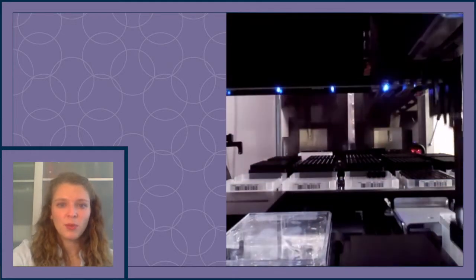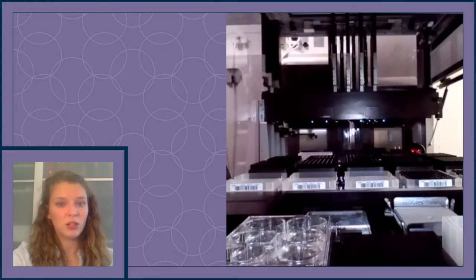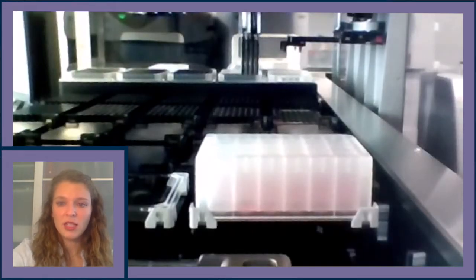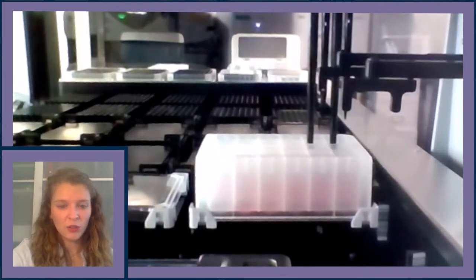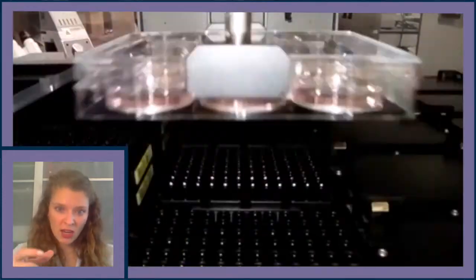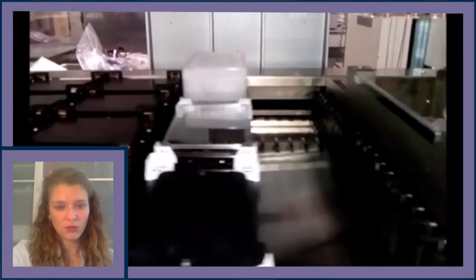After the 24-well microplate is prepared with seeding solutions, the pre-matrigel-coated six-well plates that have been incubating for two hours at 37°C are brought onto the tilt module. All matrigel is removed, and one milliliter of mTeSR1 plus rock inhibitor is added to each well. New tips aspirate 500 microliters per channel from row C, and the seeding solution is added at particular locations within each well using two channels per well, totaling 1000 microliters of cell suspension per well. The plate is lidded, picked up by core grippers, and rapidly moved to simulate manual shaking to disperse cells evenly, then returned to the Cytomat 24.